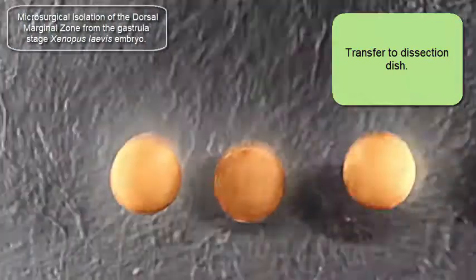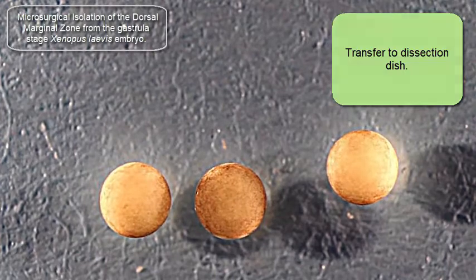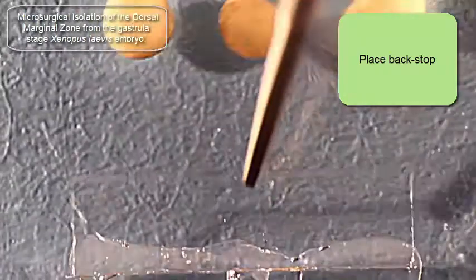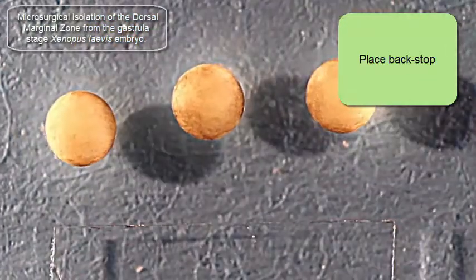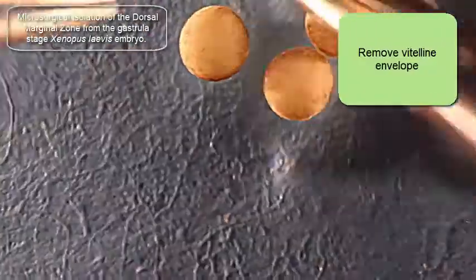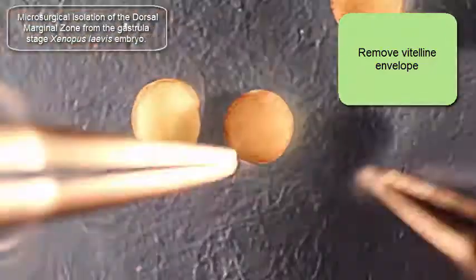At this point I'm going to place a backstop into that dish so that I have basically a third location — a third hand — in the microsurgery steps to follow. Then I'm going to take off the vitellin envelope with blunt forceps in the left hand and pointy forceps in the right.